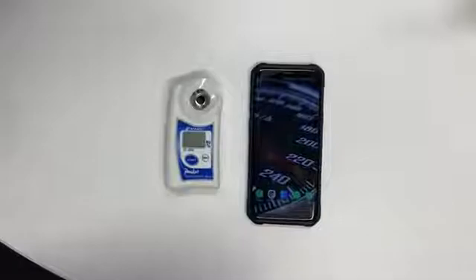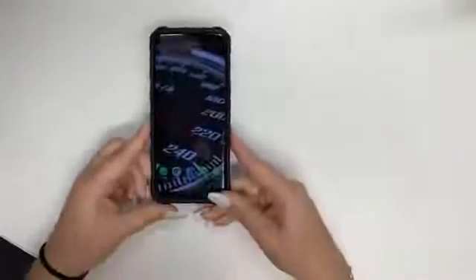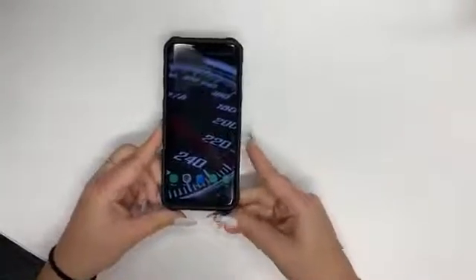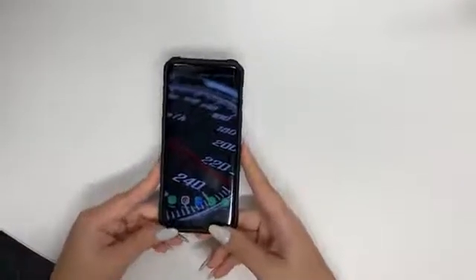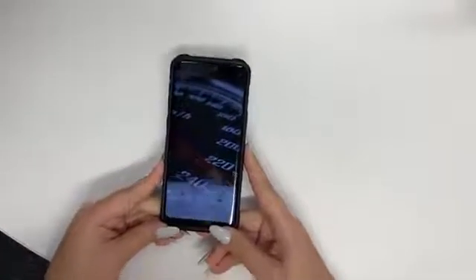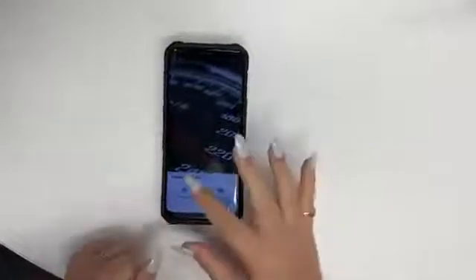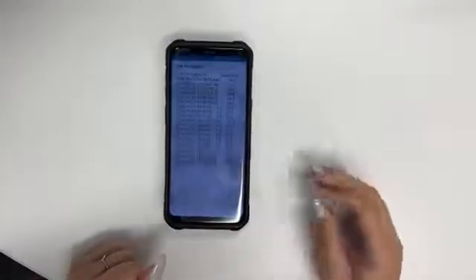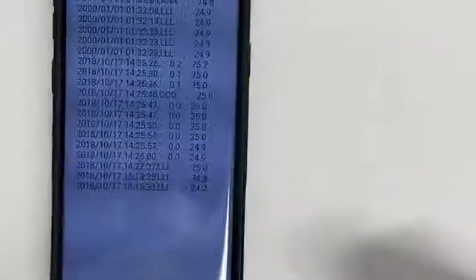To transfer data from your Atago instrument to your Android phone, just place your phone on top of the unit until the tag reader acknowledges it. You'll most likely have to move the unit around until the sensor picks it up. Some Android phones have the tag reader pre-installed and some don't, so make sure you check this beforehand.